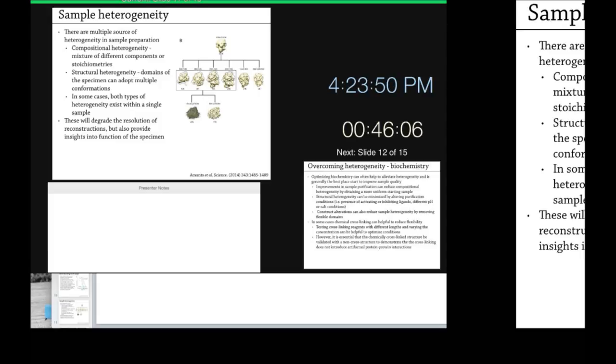And then, because they not only had heterogeneity because they had two different types of ribosomes, they also had different additional components. And so this is what they're showing as the mask for the large subunit, and you can see there's different amounts of density outside of that mask. And so by putting a mask around it, they were able to ignore everything outside of it, just look at what was inside of the mask for the large subunit, and build a reconstruction of that. And so they had some bad particles, but the majority were these good particles. And so from a relatively small particle population, they're able to sort out a lot of junk and get a very high resolution reconstruction.